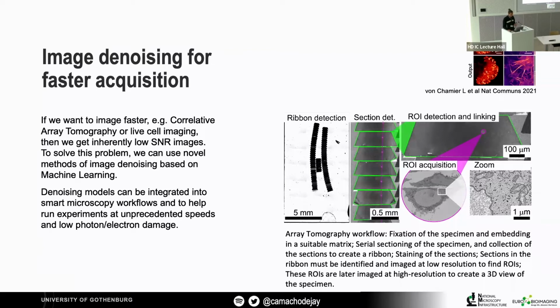And one of the other interesting alternatives could be, could we build into the acquisition pipeline already the acquisition of the data sets that we finally use for the training of the networks, right? As you know, in some of these methods, it's needed to have pairs of images of high signal to noise versus low signal to noise ratio and so on. So it would be extremely useful if we could also start to build all of that into the system.